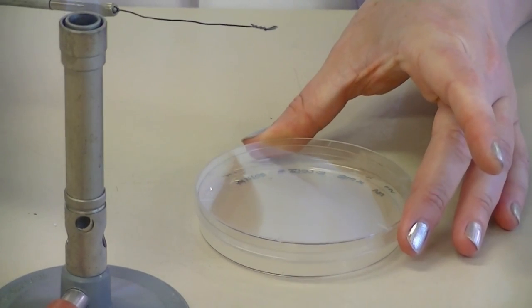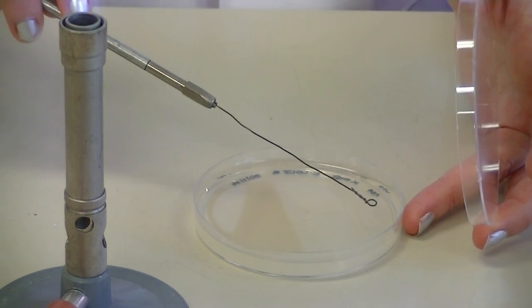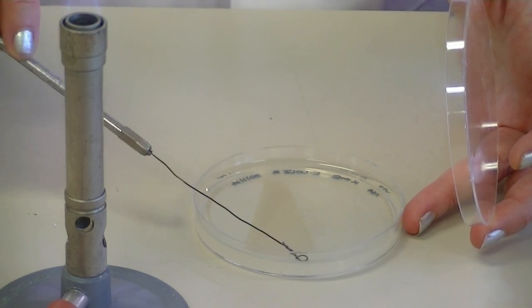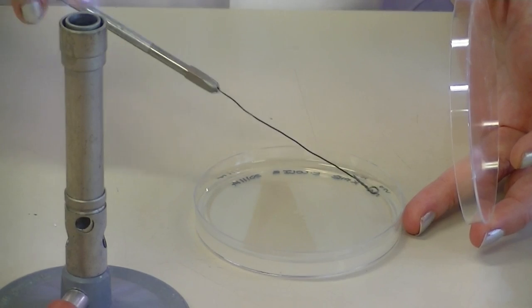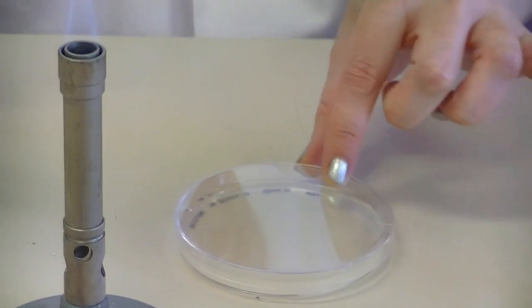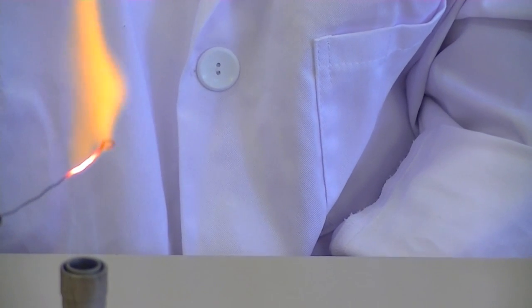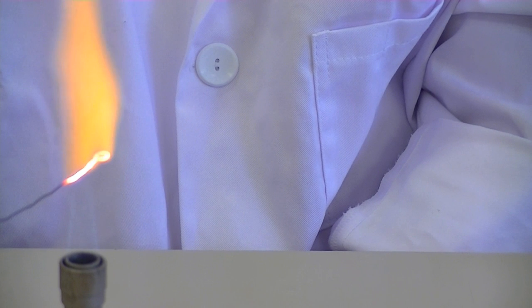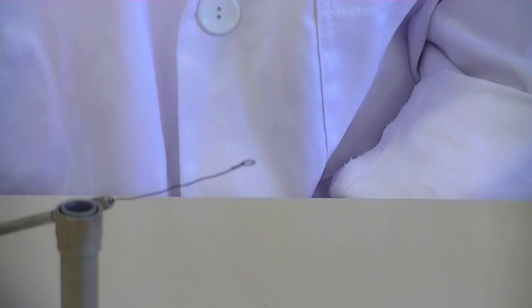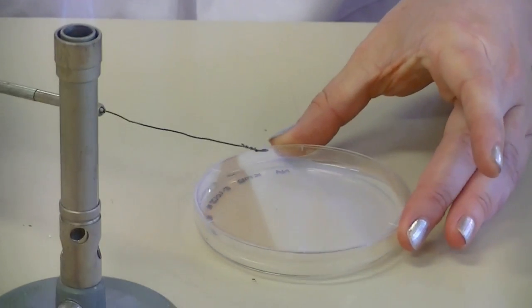To make sure that my loop is cool, I'm going to touch it to the middle of my plate and then intersect the secondary lines to create the tertiary lines. Lift the loop off after each separate line and then turn the plate ready for the final set of streak lines. Sterilise your loop and allow it to cool.